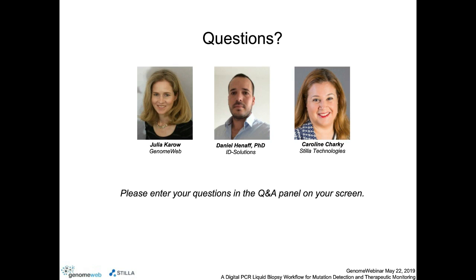And we are developing the Opal chip that I mentioned that allows you to have higher throughput, so 48 samples per run with 3 different colors, and the reading step is then a little bit longer, so it's 20 minutes instead of 10 to 12 minutes for 48 samples. So now if we go on a reader where we address 6-color multiplexing for 48 samples, the reading step itself will be between 45 minutes to an hour. So it will be a little bit more, but we're trying to reduce it as much as we can and to have it as closer and similar to the current 3-color reader.